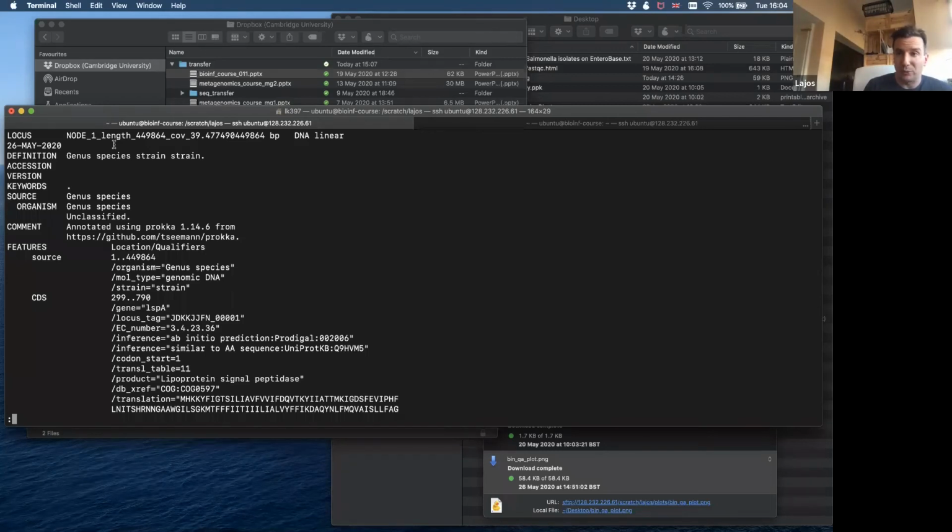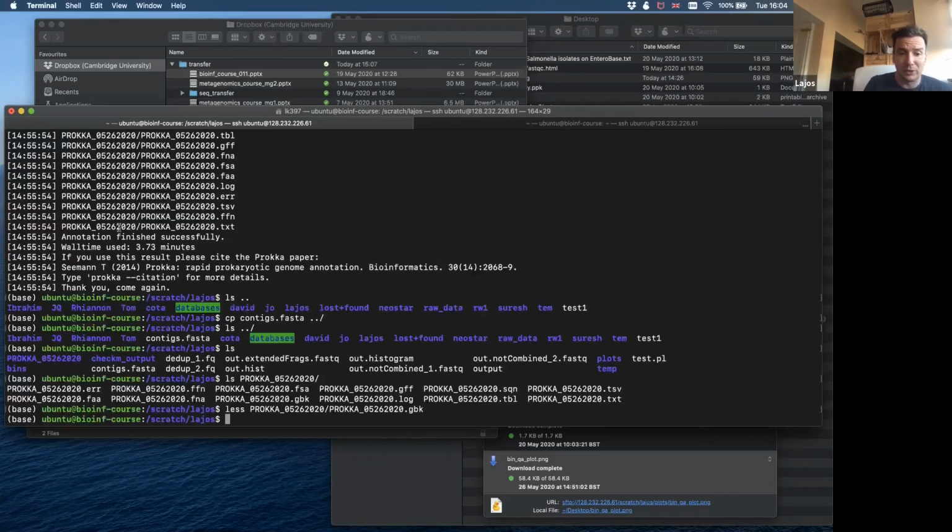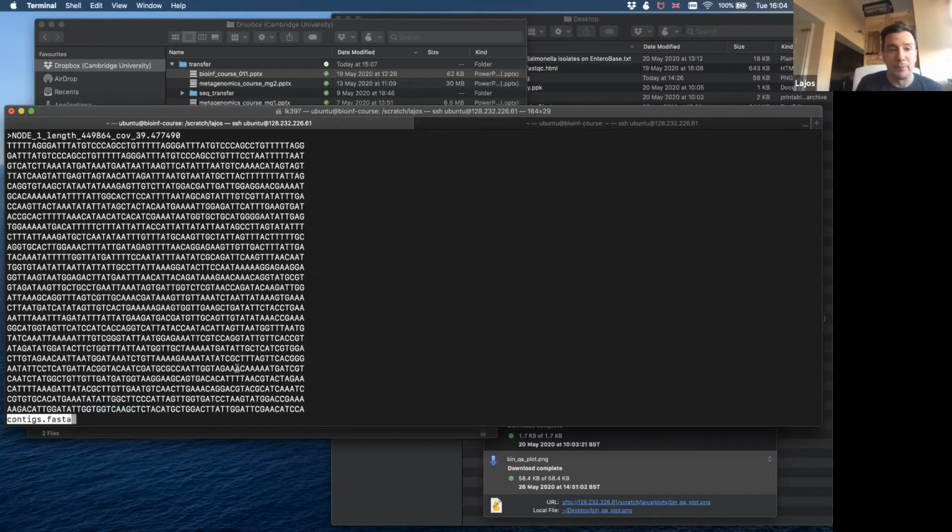If you want, we can do this next time: a short R script that reads in your original file. If you look into your contigs FASTA file, you can ask the script to truncate all these lines and go back to like 10, 15 or 20 characters.